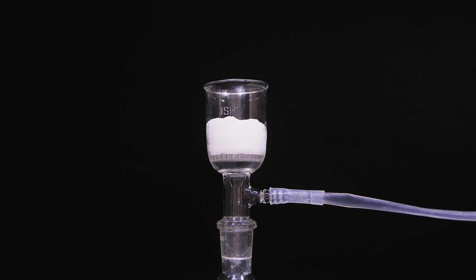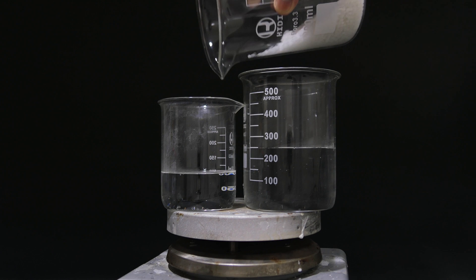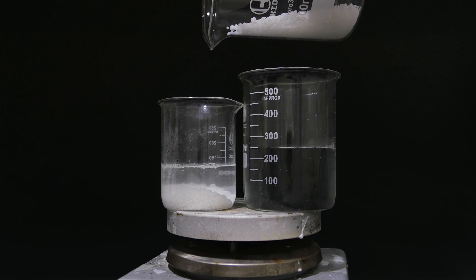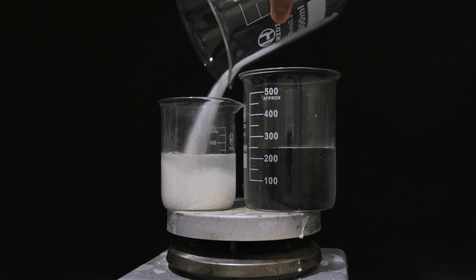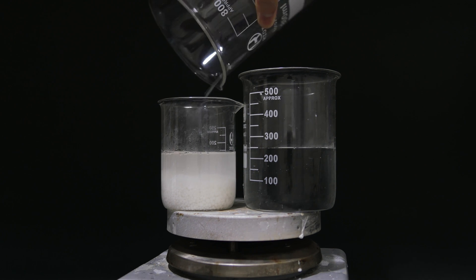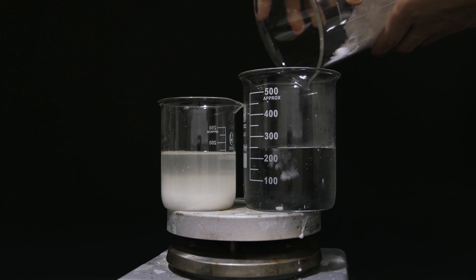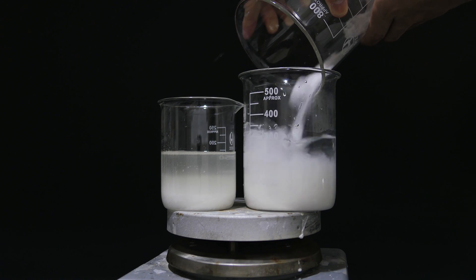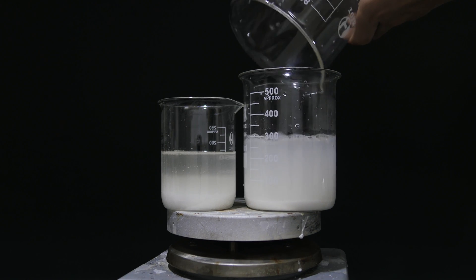Next, I need to make another precursor, barium nitrate. It's made by mixing equal molar amounts of barium chloride and calcium nitrate. Any nitrate salt can be used as long as its chloride salt has high solubility, like sodium nitrate or ammonium nitrate.